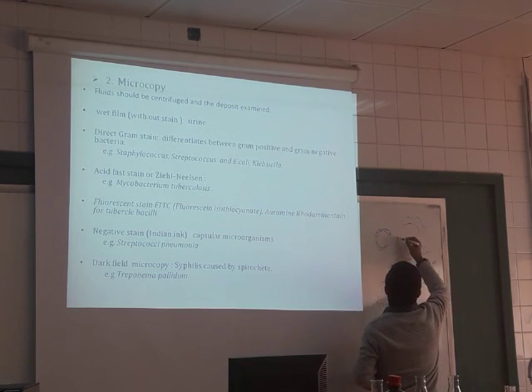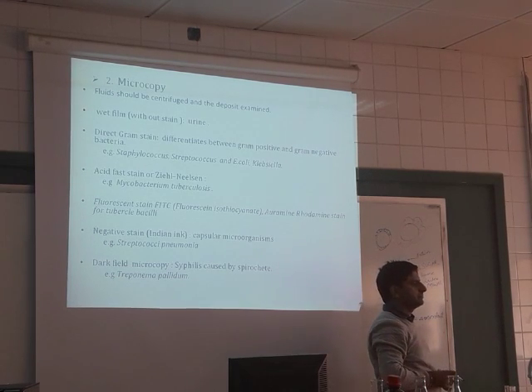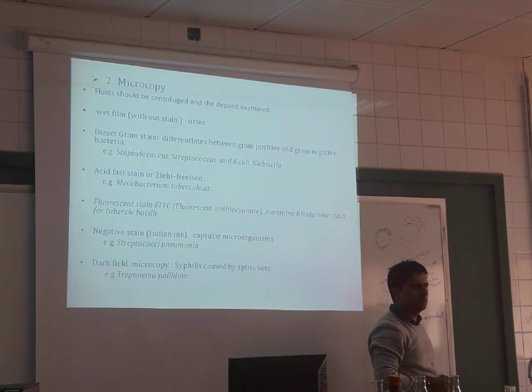Positive it will be thicker. The difference is in the bacteria, in the teichoic acid, the same stain.